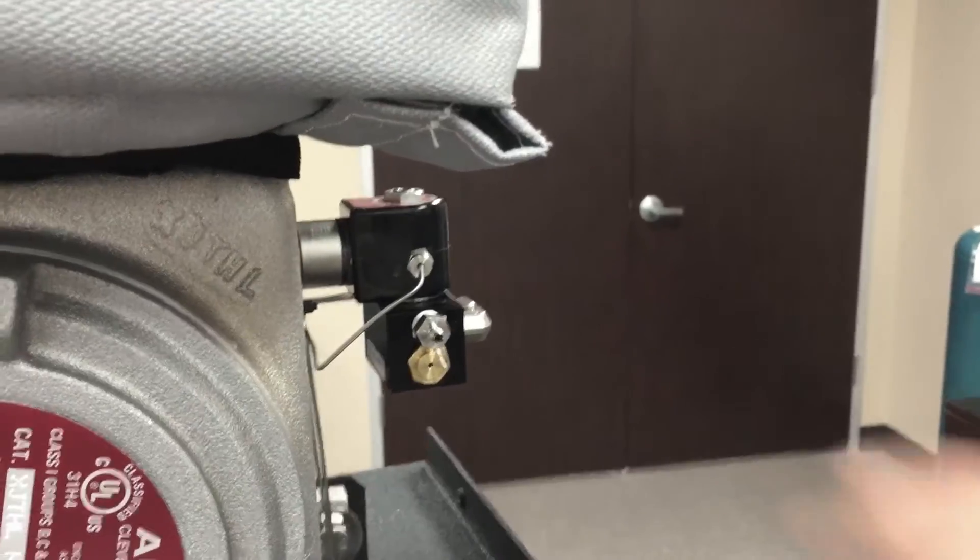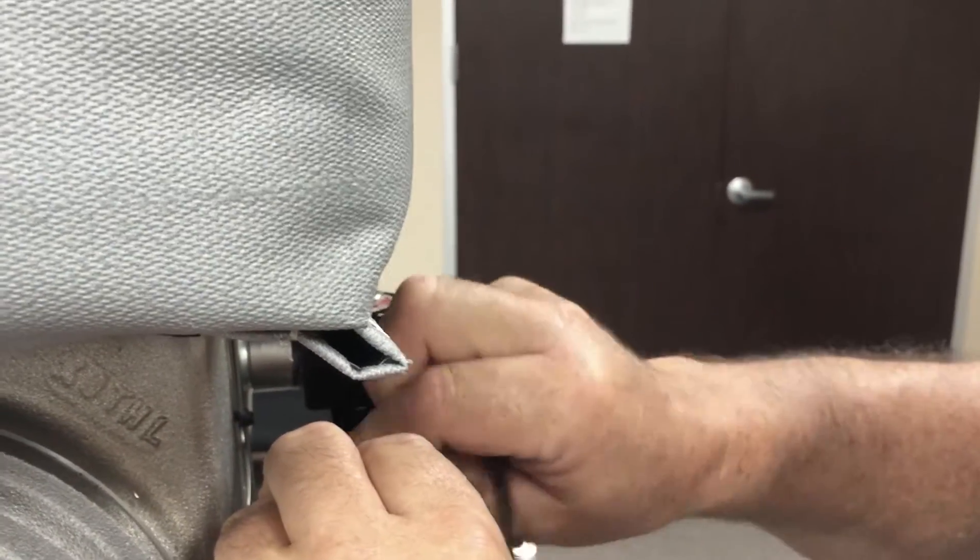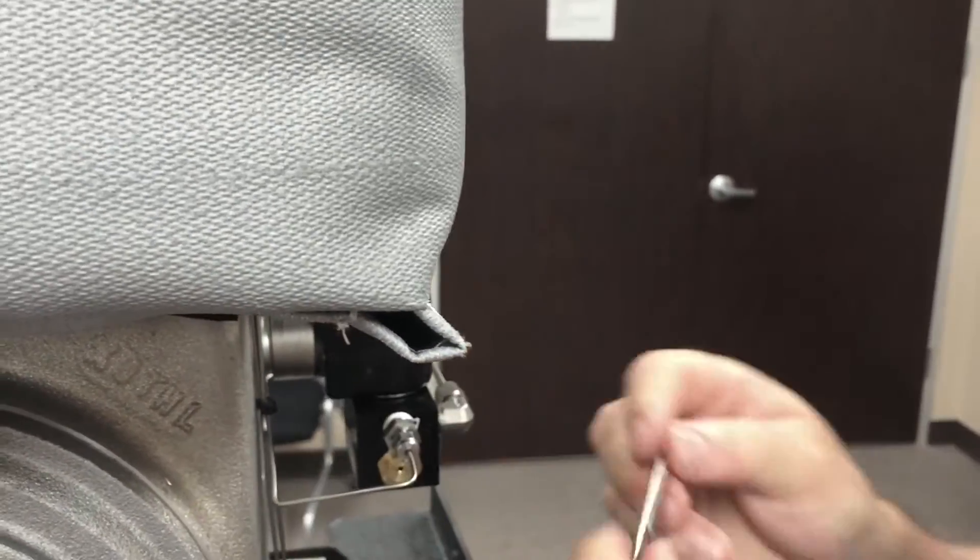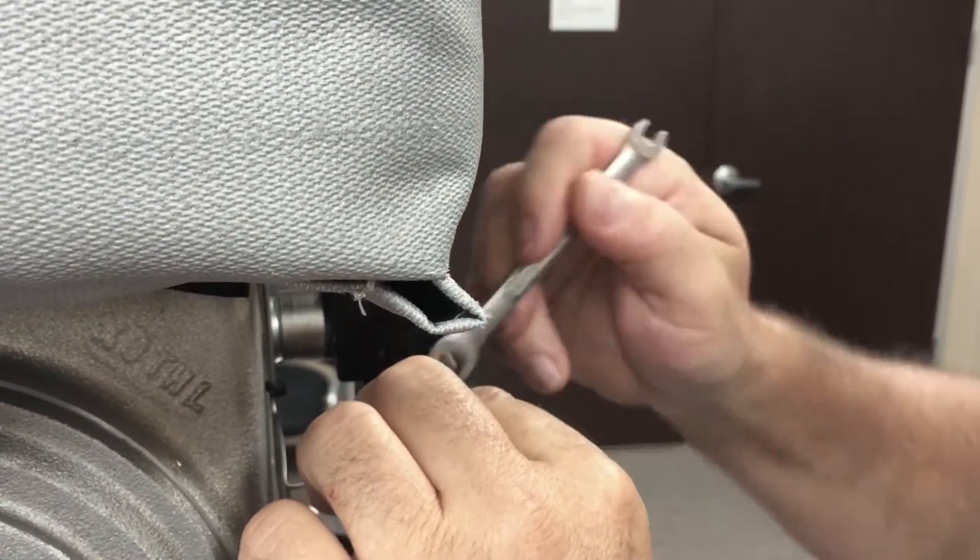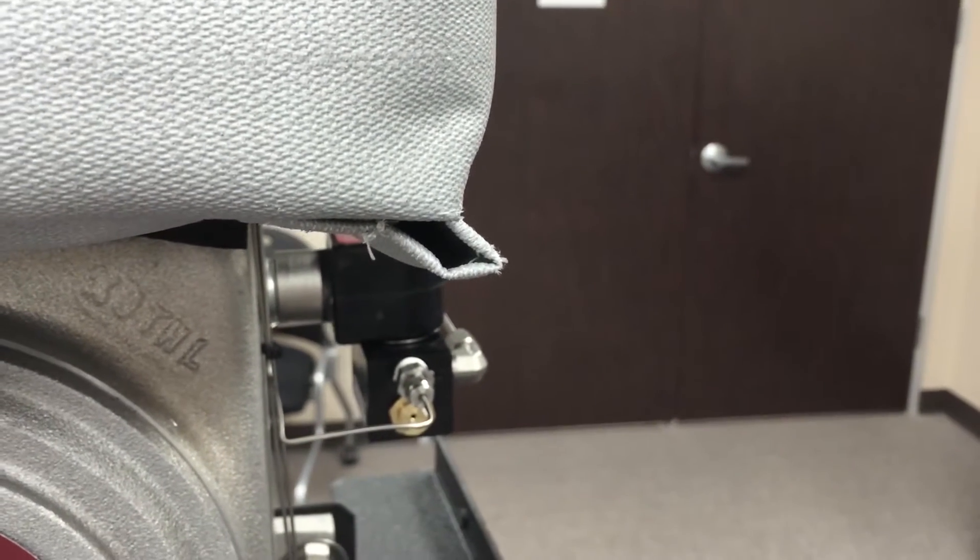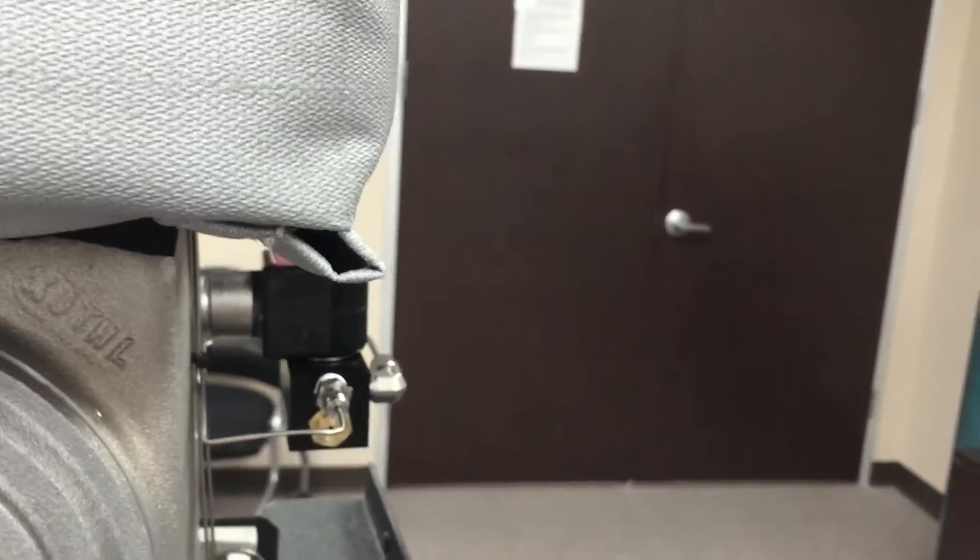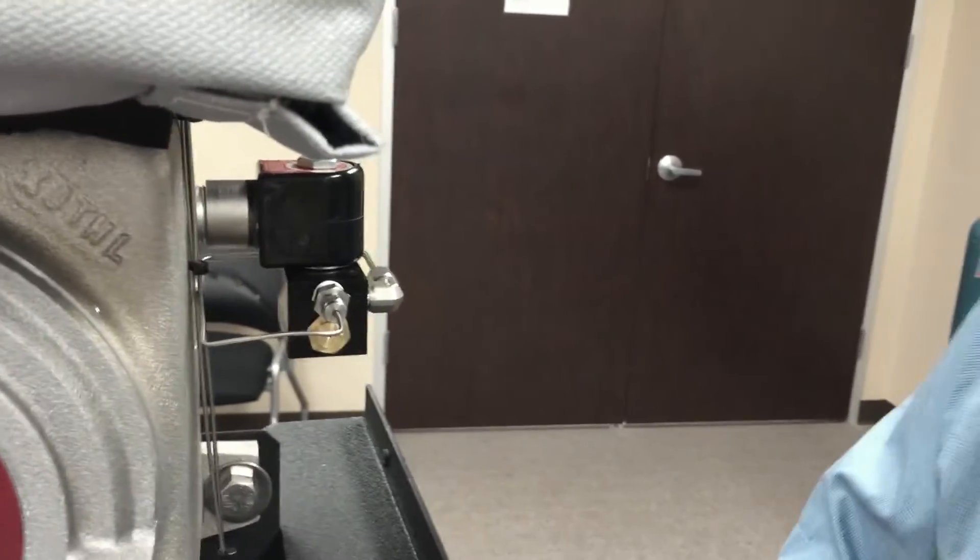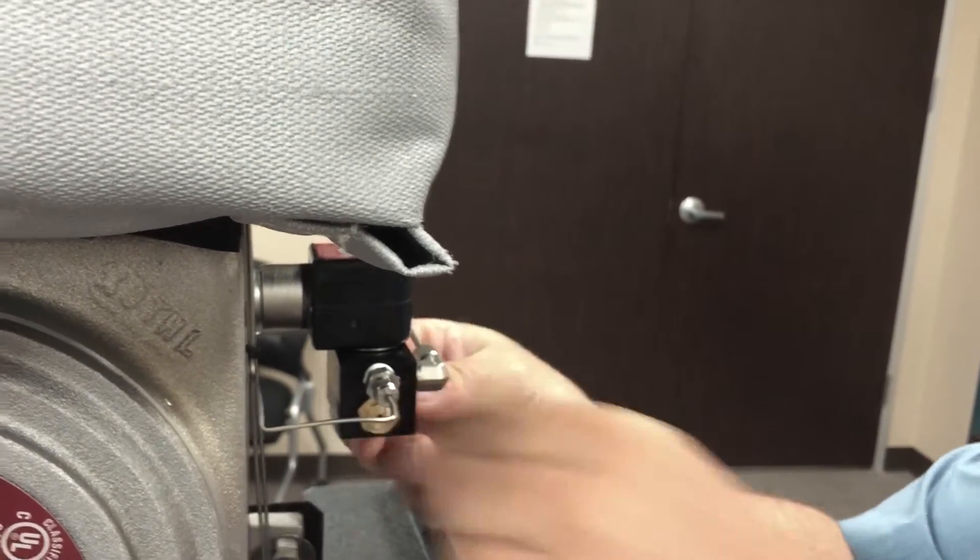Then the last step, we reattach the pneumatic line. After that's been done, we can take the label that's in the kit, peel it off, and add this to the Fabco.